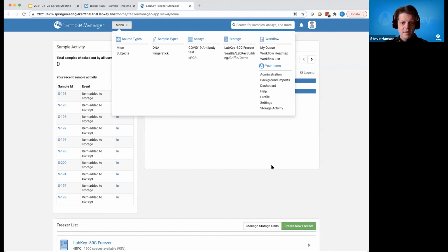Great. Another question. Is it possible to change my mind if I want to set up my sources and samples differently? Absolutely. The system is really flexible, and the upside or downside of this is that we're going to audit that mind change. If you decide that subjects do need to be a sample type, or you want to add or change metadata around that, that's no problem.